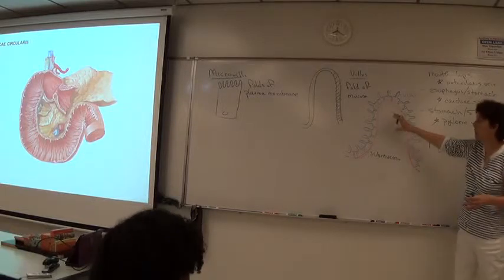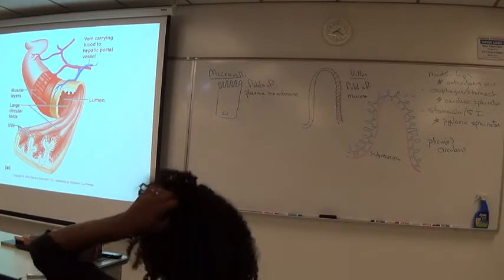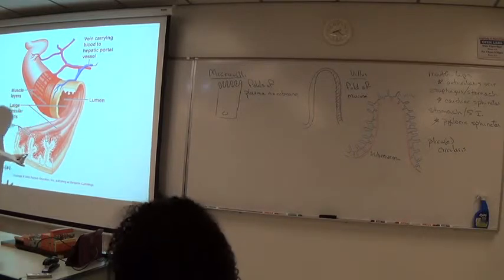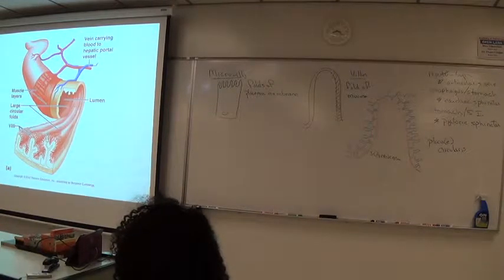All right? So this would be the submucosa in the center and the villi extending out from that surface. So here's another view. Here's that circular fold, and this would be the section through it that we see as a plica circularis.